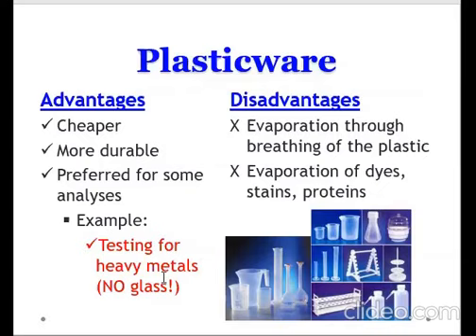If we do use glasswares, they should be totally free of contamination. And how can we ensure that it is totally free of contamination? Of course, our glasswares should be carefully and thoroughly cleaned. If the question is how we properly clean glasswares so they can be used for heavy metal testing, that will be answered later on.